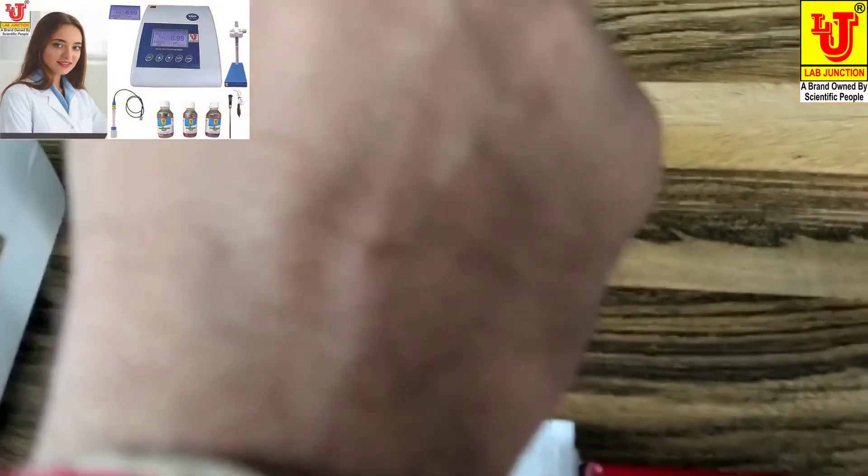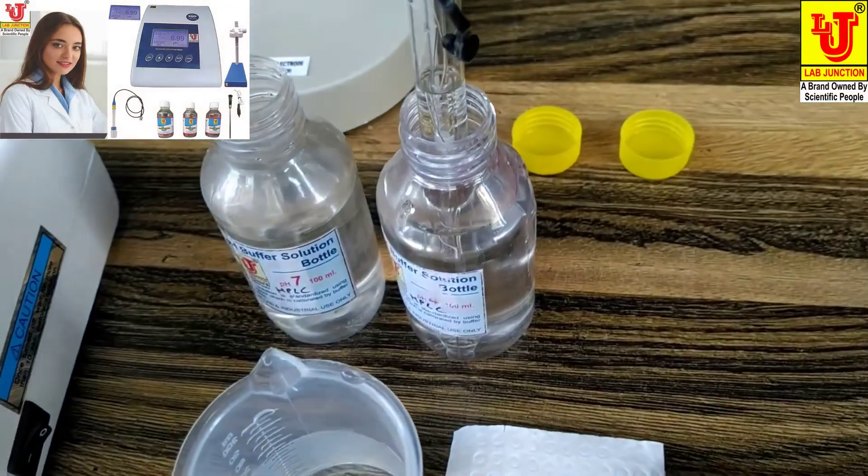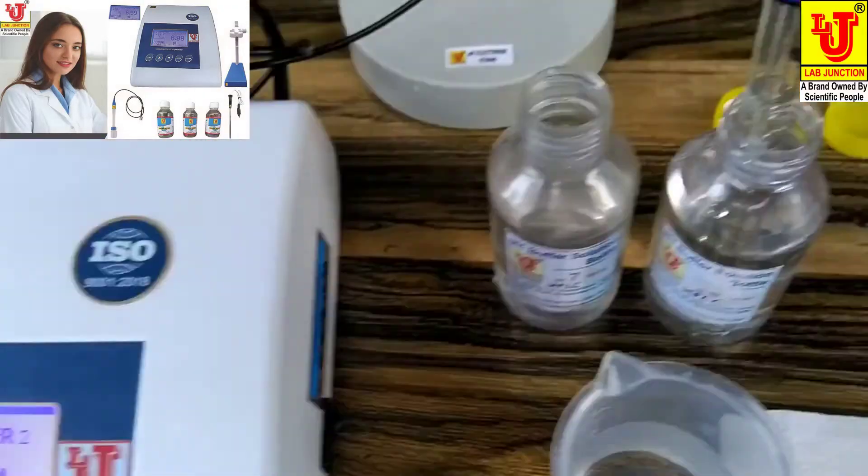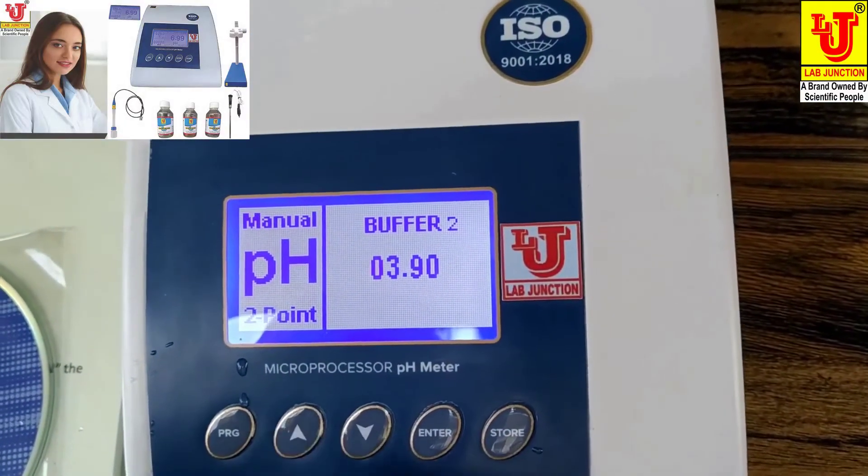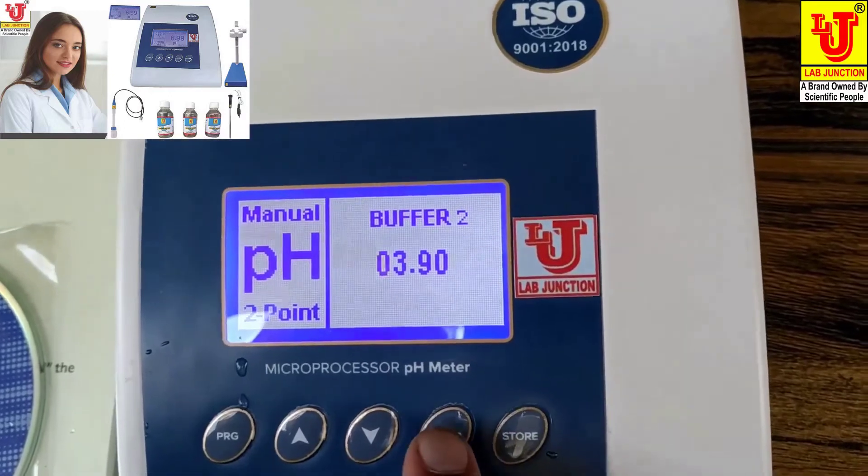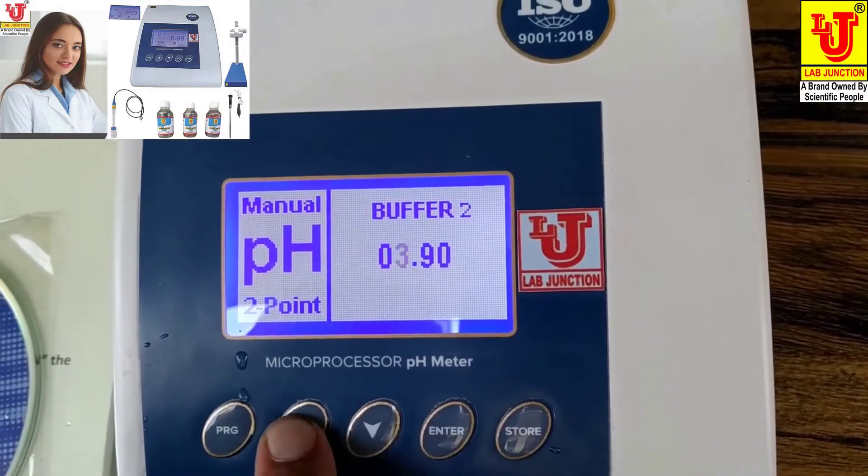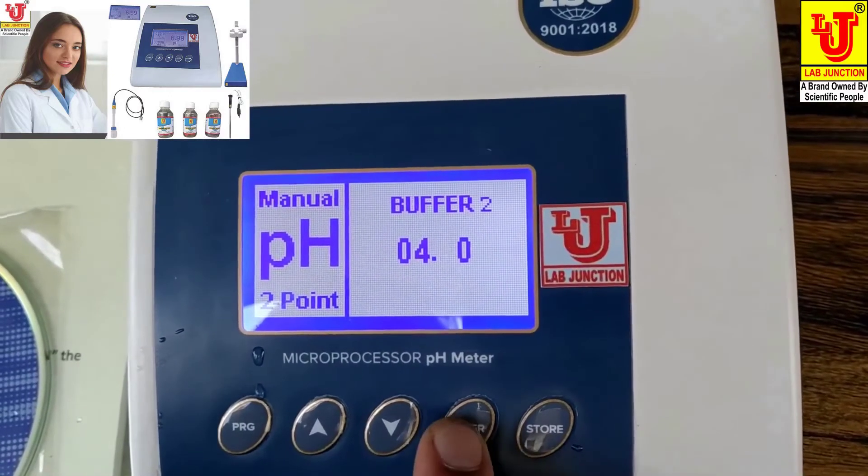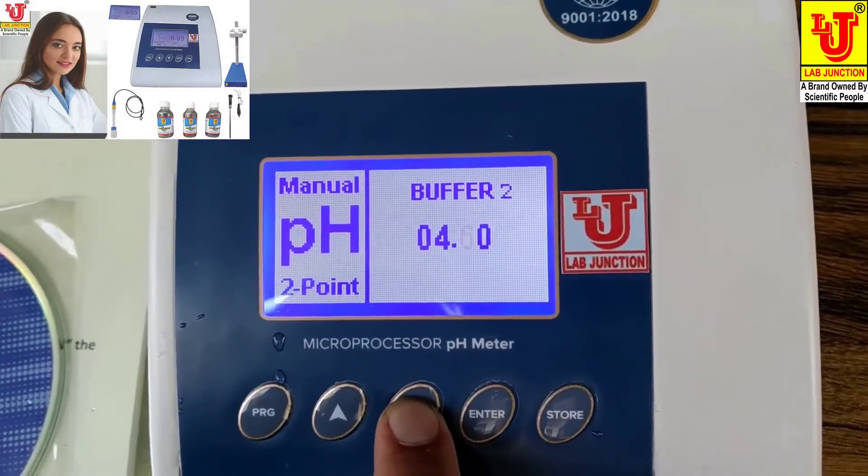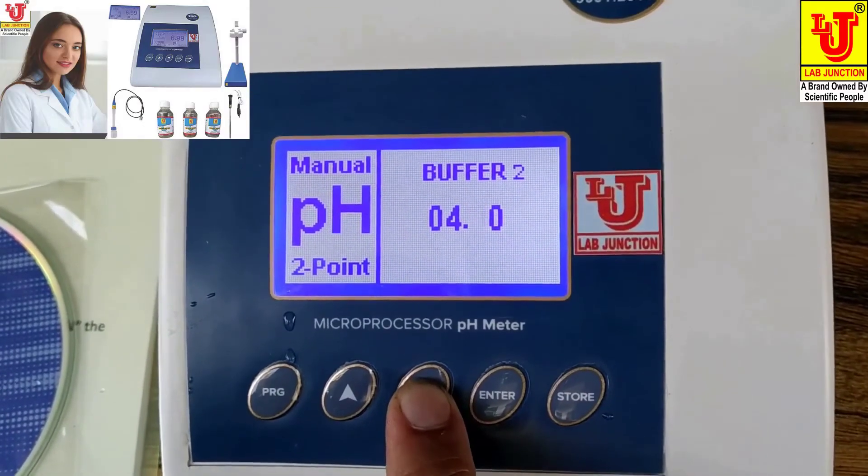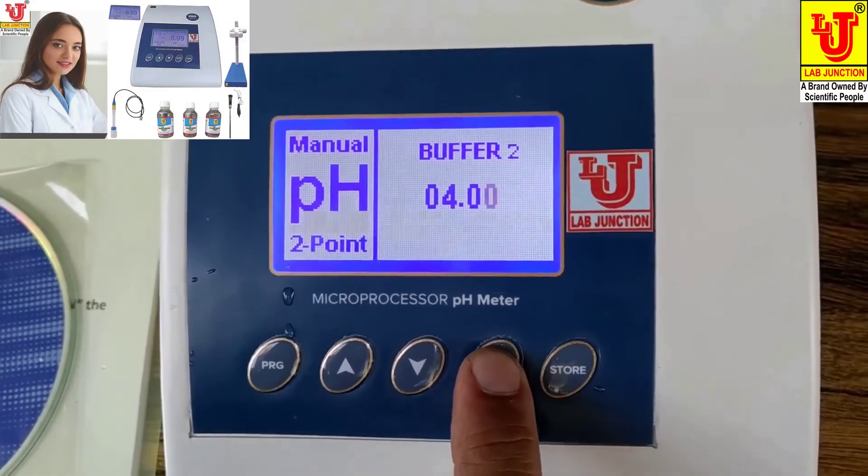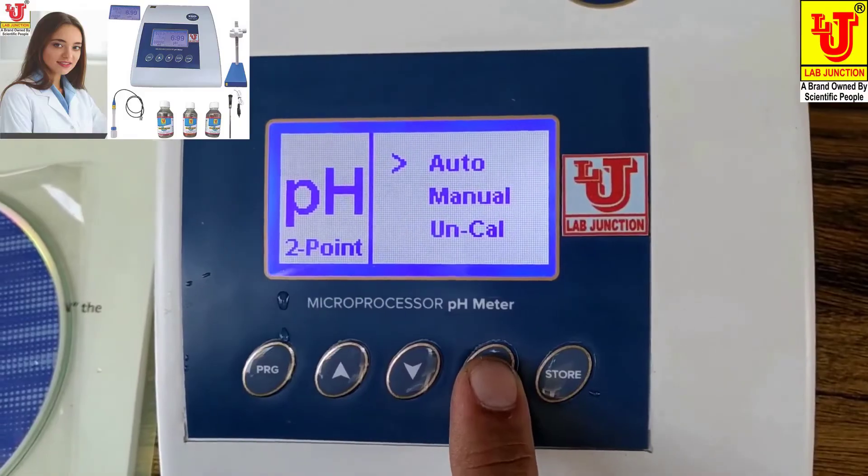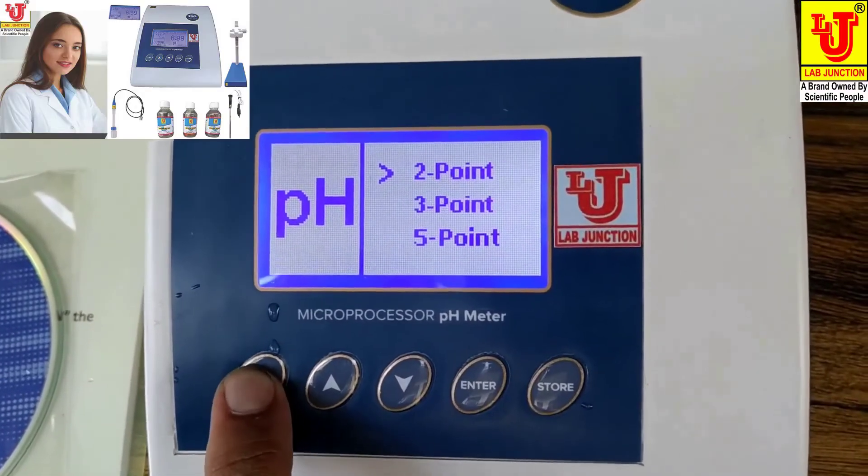And you dip your pH electrode to pH 4 buffer. Again you can set your own value. This is, suppose you want to 4 set. 4, enter. Calibrated.